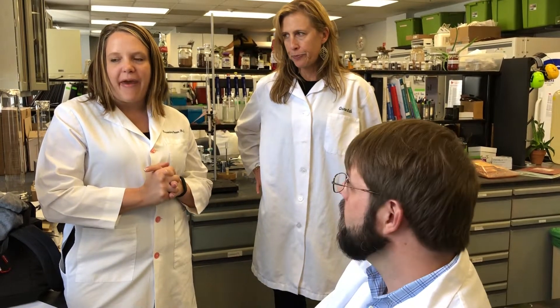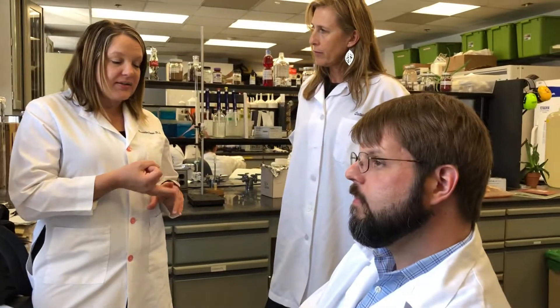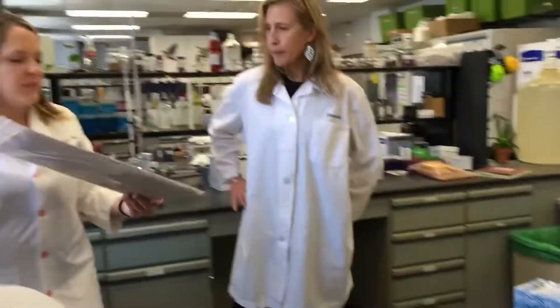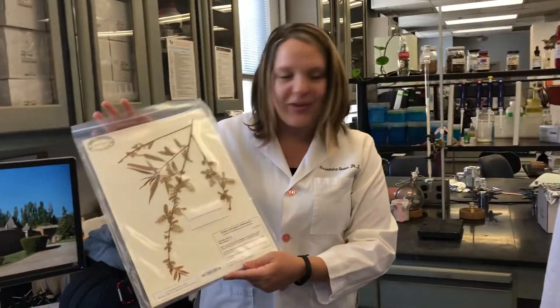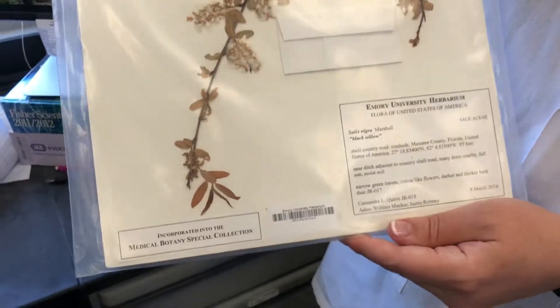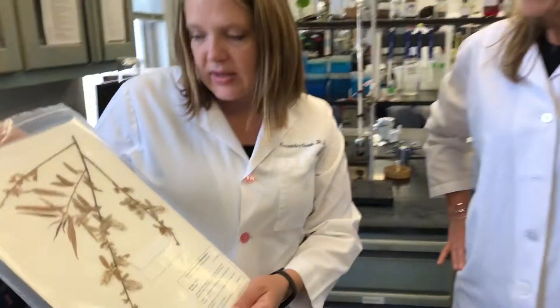In the other lab, we have all the biological assays that we run. We're looking at things that inhibit bacteria that are really dangerous to humans. We also look for things that are safe to human cells at the same time, so we do counter-screening to ensure that whatever we're developing is not going to be harmful to humans — it's very specific. In the herbarium, which we'll visit later, that's where we keep all these kinds of specimens. These are herbarium voucher specimens — when we were in the field we were collecting these, and when they come back to the herbarium they get pressed onto nice paper.